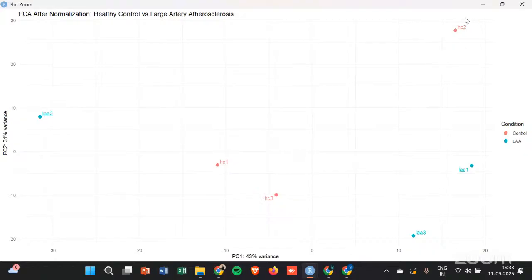If I remove a sample from each, I am violating the minimum criteria required for any robust statistical analysis. This is a bottleneck. Even though I can clearly see I have outliers, I cannot really remove them, and I have to go ahead with the analysis. This is a very real problem that a lot of labs face, because they only sequence the bare minimum.